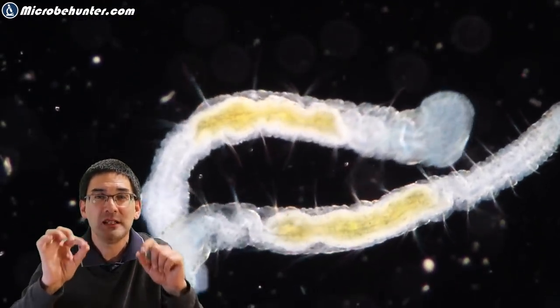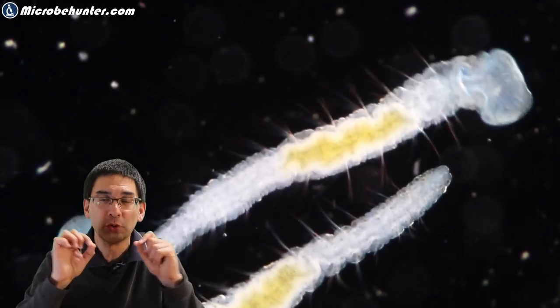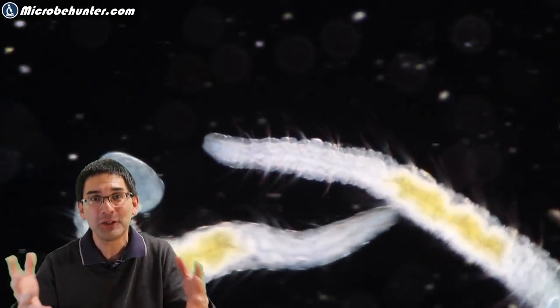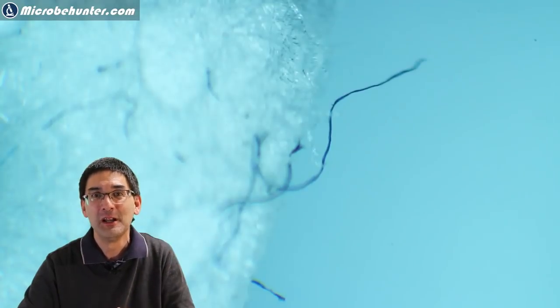And as a matter of fact you can see even into the worm and you can see the organs and I think it should be very clear from these video clips here that they look very different to the moving fibers.